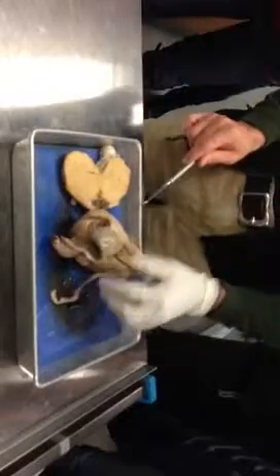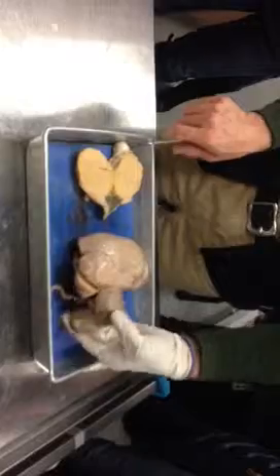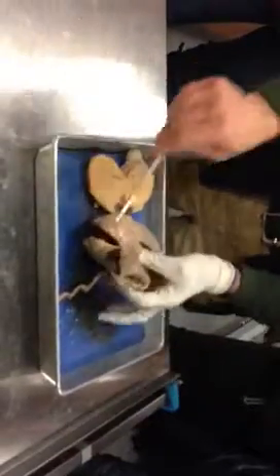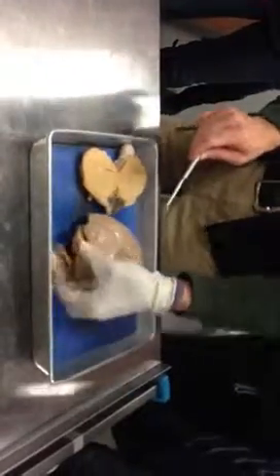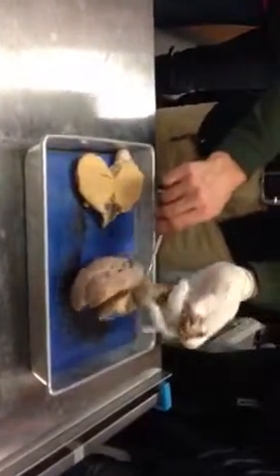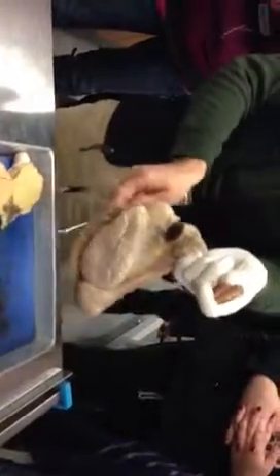I guess working our way back out, I'm going in no particular order. On the outside, once again, the spermatic cord would be all of this. This is the vas deferens, by the way, which is part of the spermatic cord. It's been dissected here, but this whole thing that I'm holding, including the vas deferens, is the spermatic cord. And that's kind of how the testis would hang inside of the scrotum.